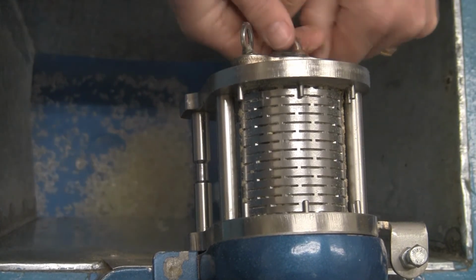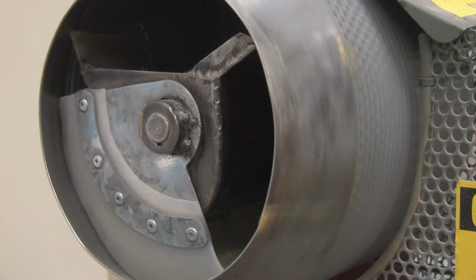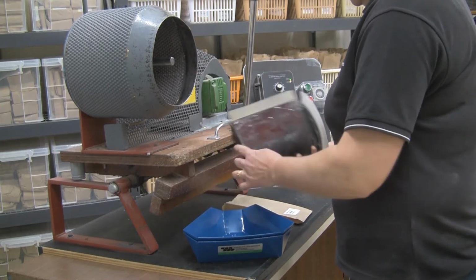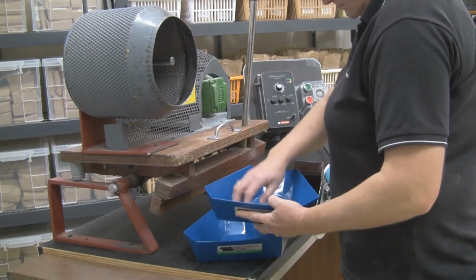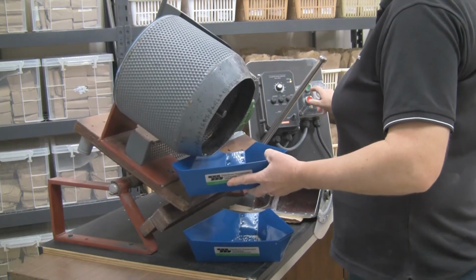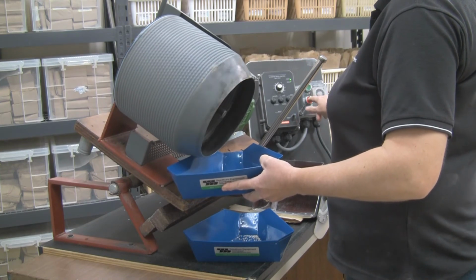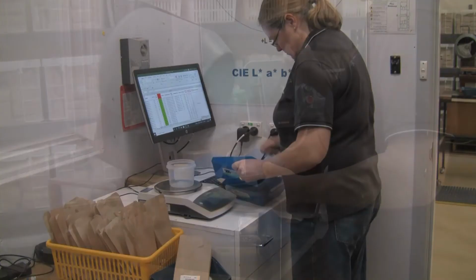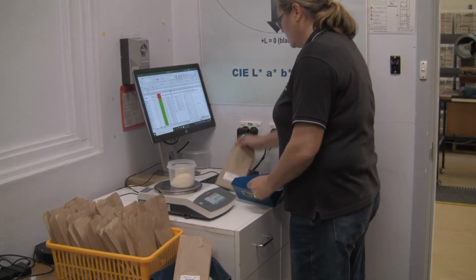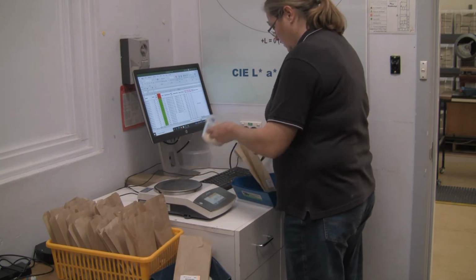The final step in the process is to separate the broken rice. We do this by using a piece of equipment called an indent cylinder, and therefore this process is referred to as indenting. After a set time of indenting, the operator collects the separated brokens and whole grains and records the weight of each. The brokens are then discarded whilst the whole grains are retained for further analysis in the quality evaluation program. The whole grain weight is then used to determine the final whole grain yield.